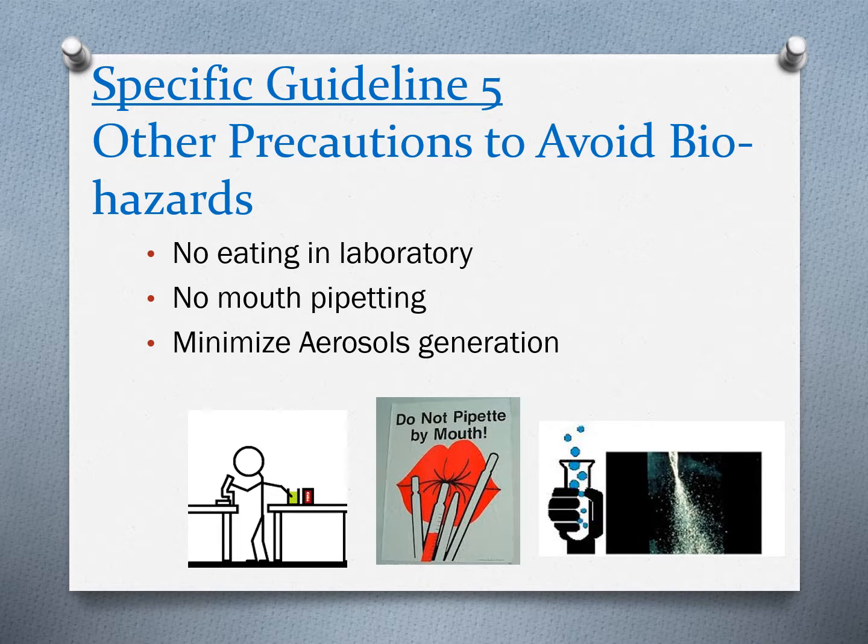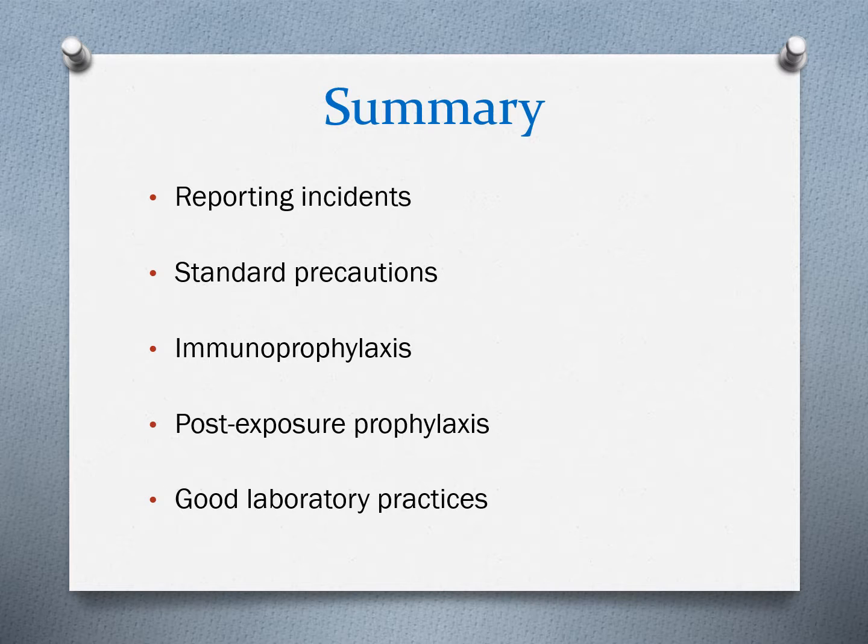Other precautions taken to avoid biohazards are no eating or drinking within the laboratory, not even after working hours. Absolutely no food or drink must be stored in a laboratory refrigerator. No mouth pipetting. It is a procedure that has been banned across all laboratories. Care should be taken to minimize aerosol production.